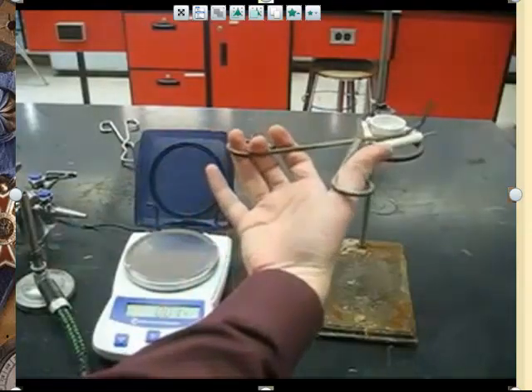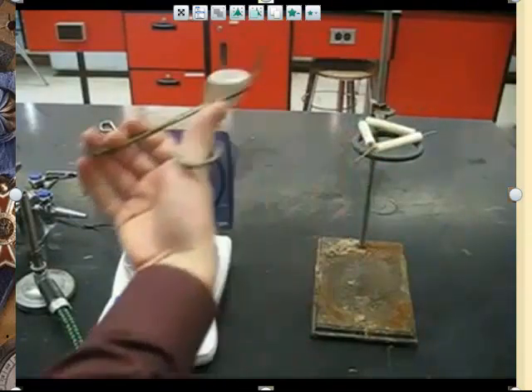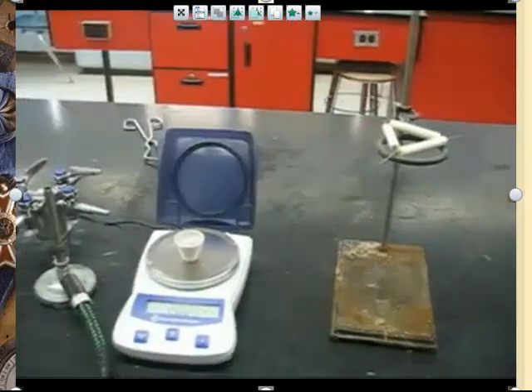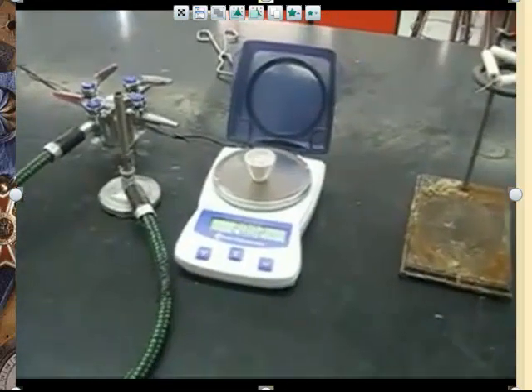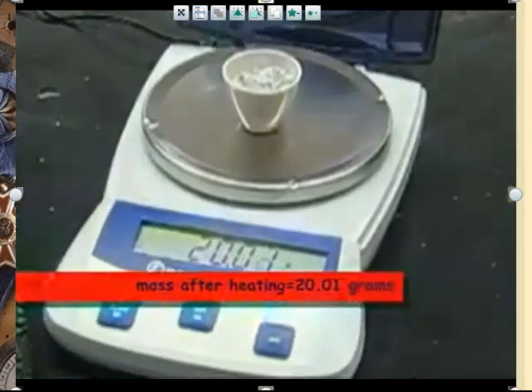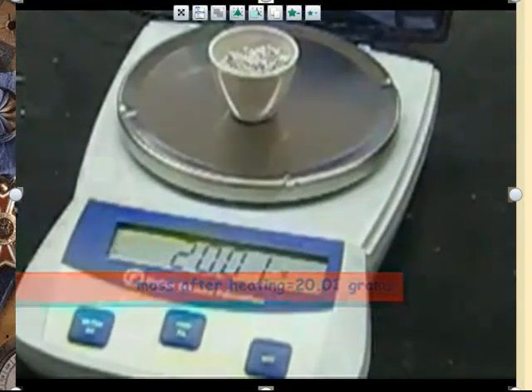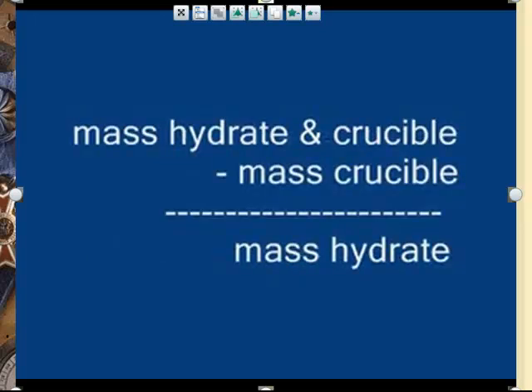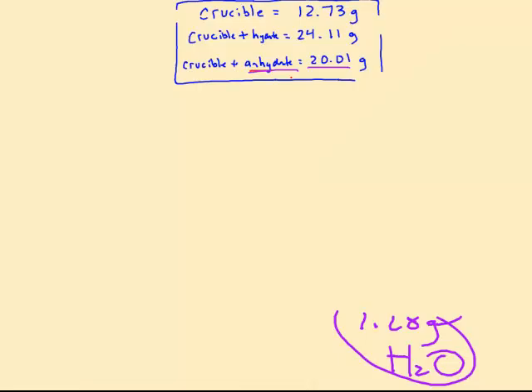So then once we let it cool, we can pick it up again with our hand, put it on the balance. So now the next mass we need then is what happened? Well, the water was heated away, and now we have 20.01 grams. So now we have all the information we need to solve the math.